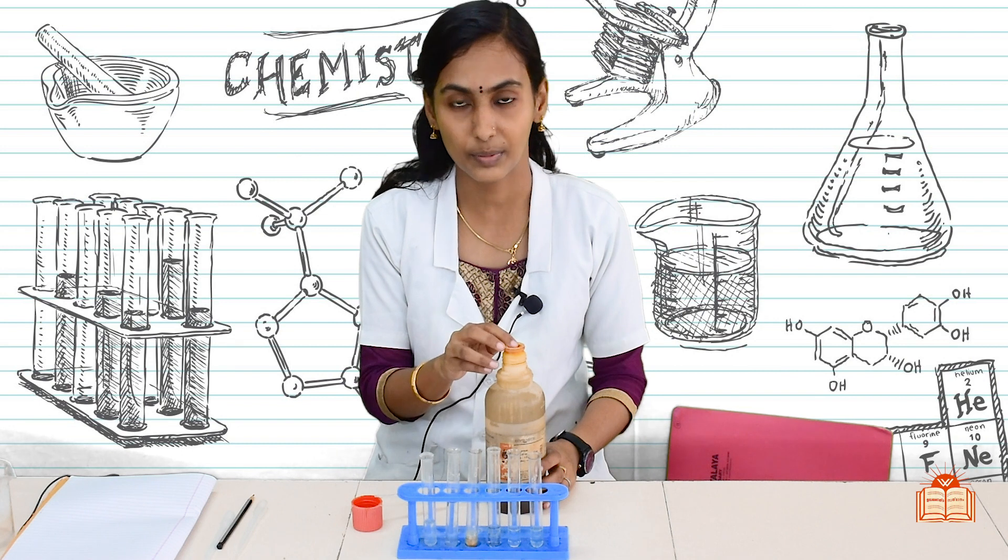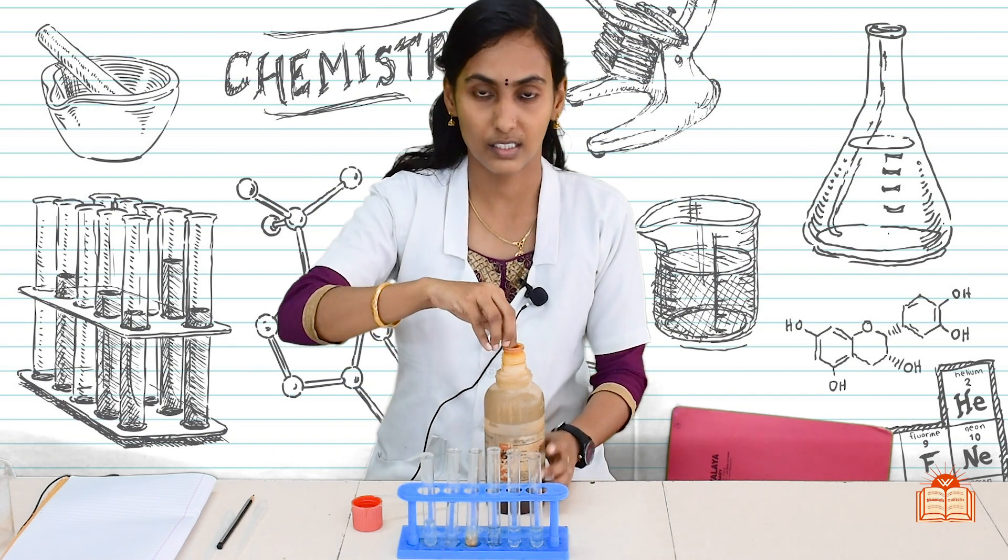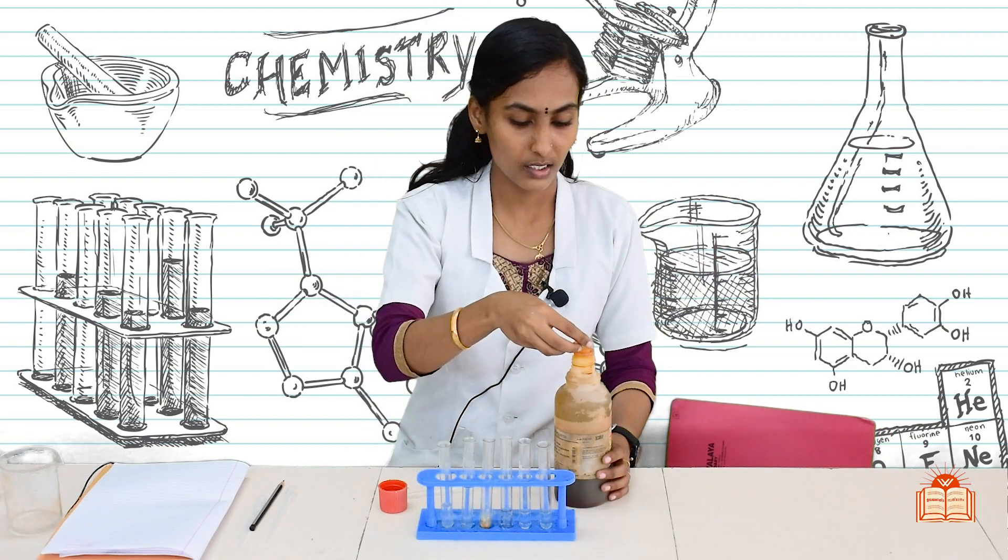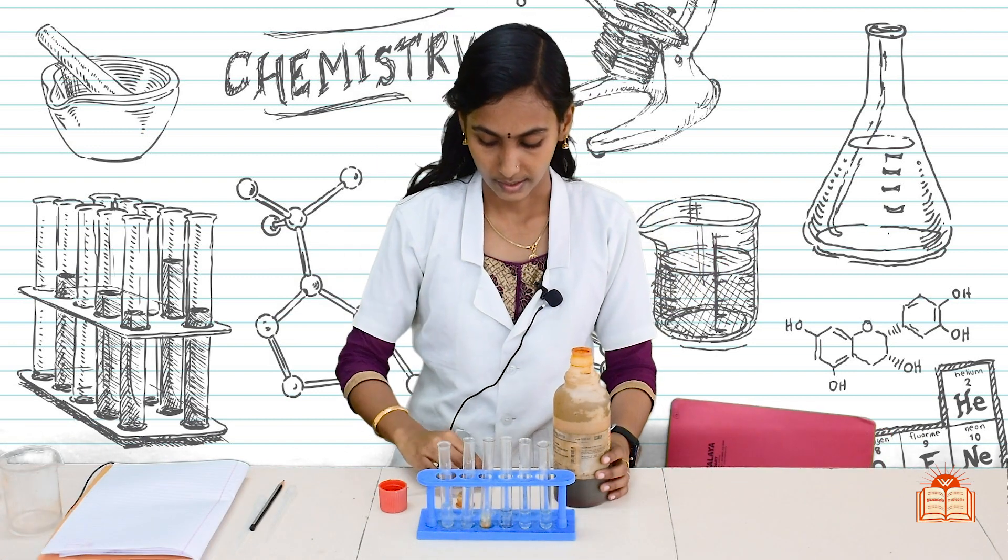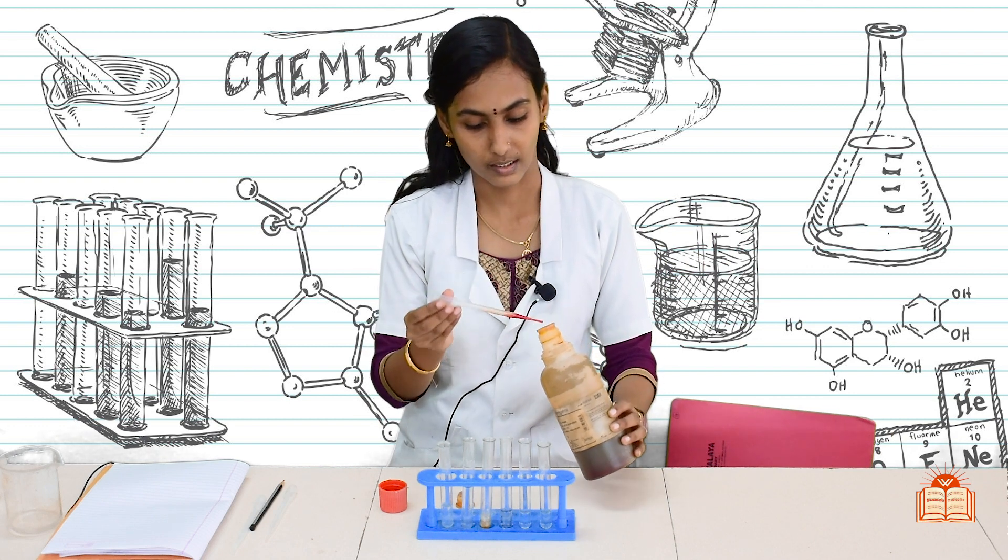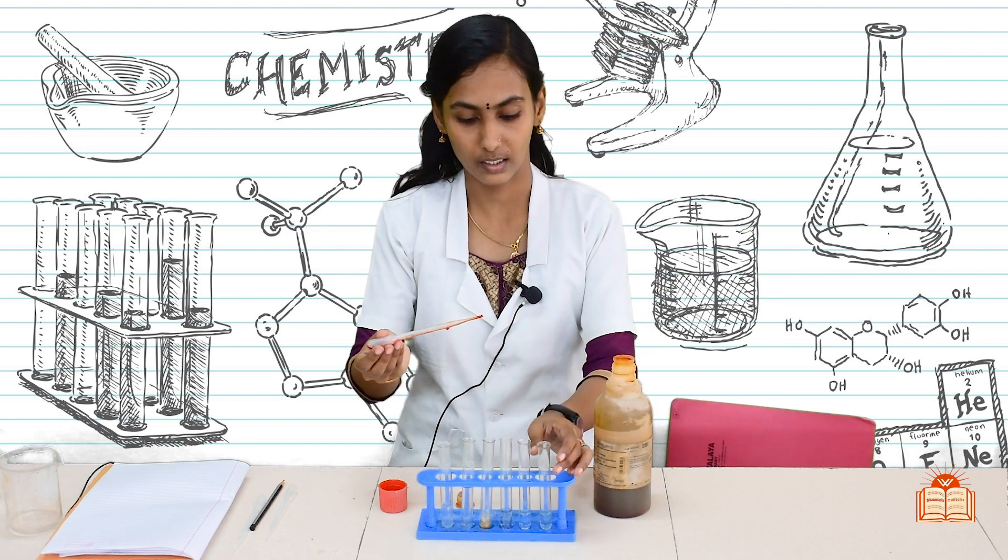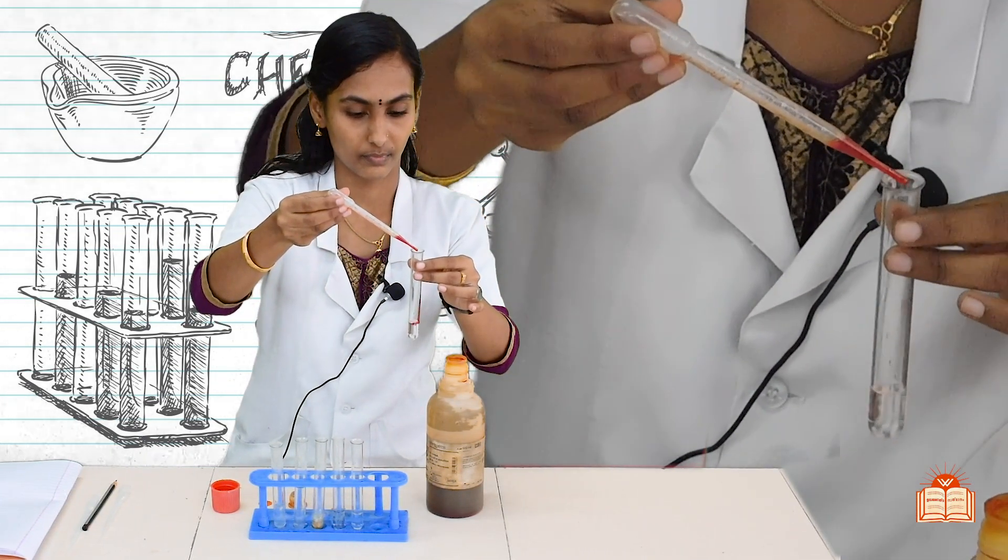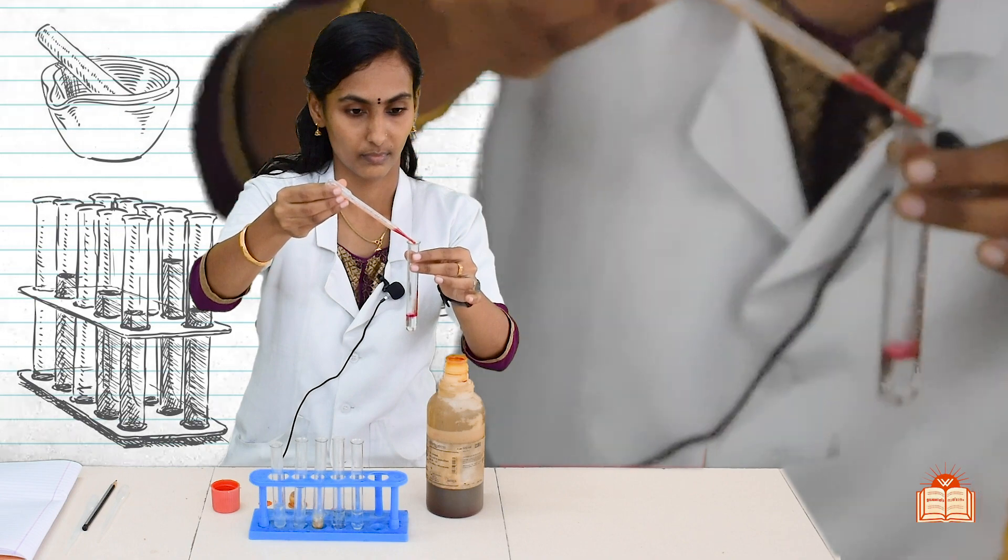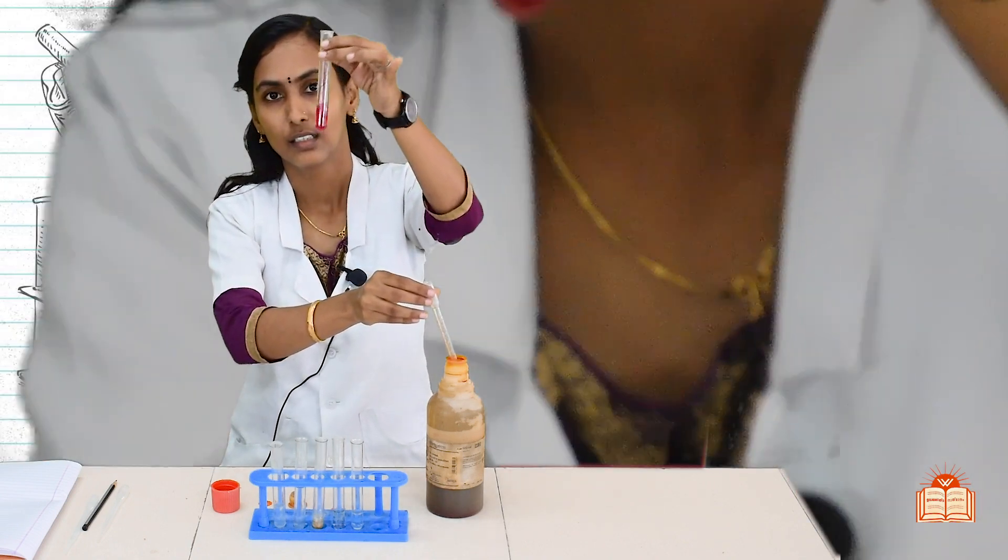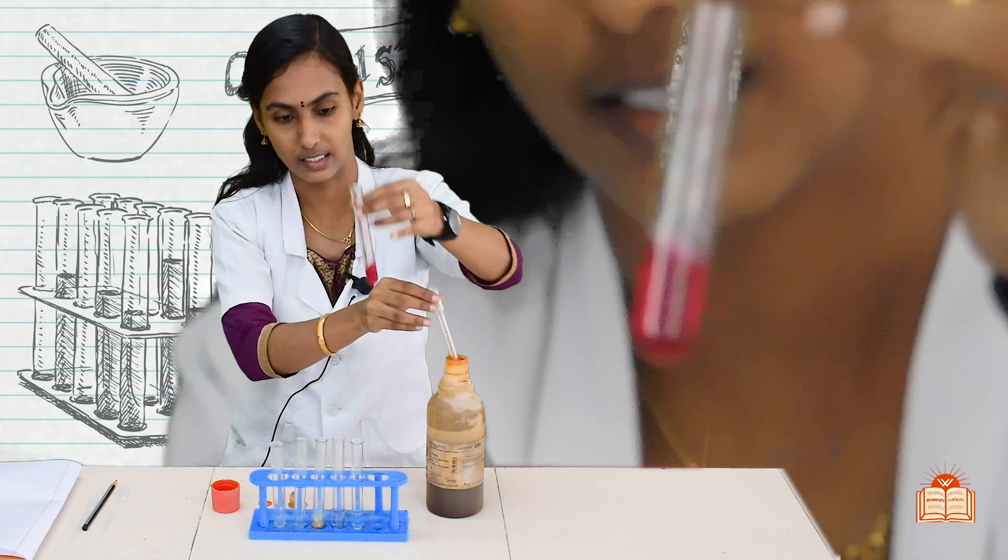You will get various colors and as per the colors and the pH scale, we can identify the strength of acidic or basic solution. Using this solution, we can identify the nature of the substances. Take some drops of universal indicator and add this to dilute HCl solution first. See, what is the color? It turns to dark pink color.